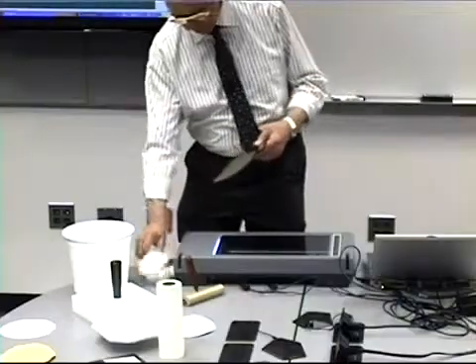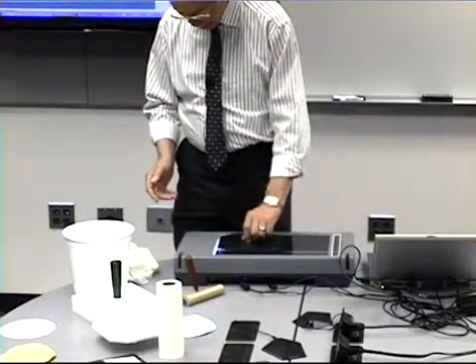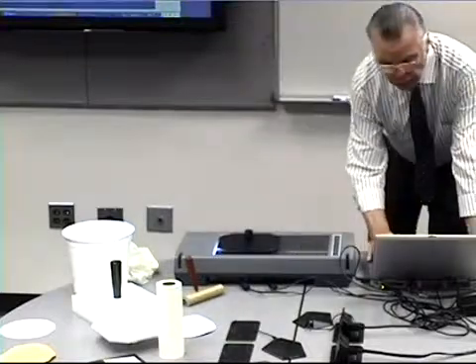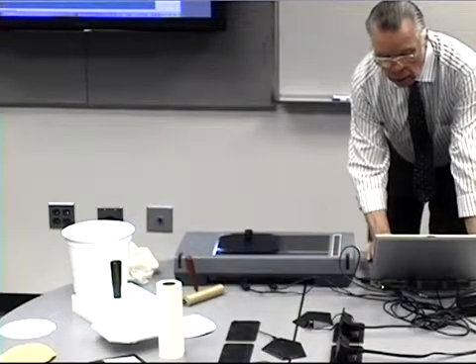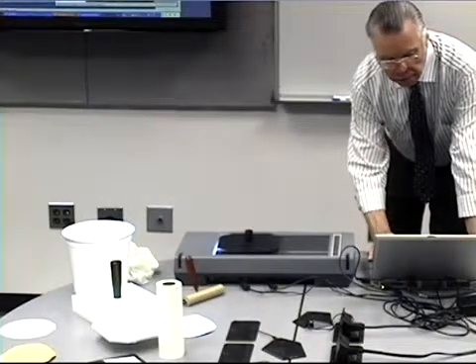We'll put this on the scanner and we'll tune it up and show you that we can in fact quantify the count of stickies and the area occupied by the stickies using just the same software, but set up a little bit differently. Let's make a scan. We'll do a preview scan.